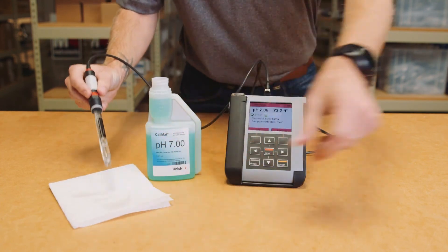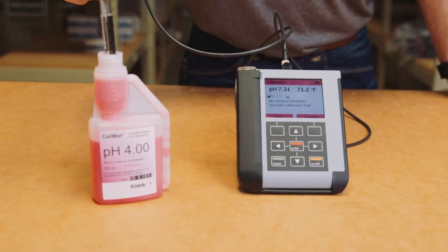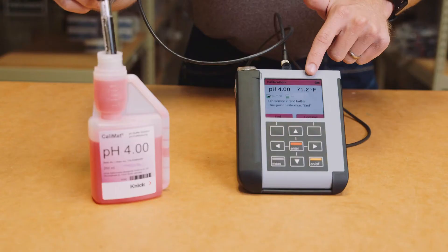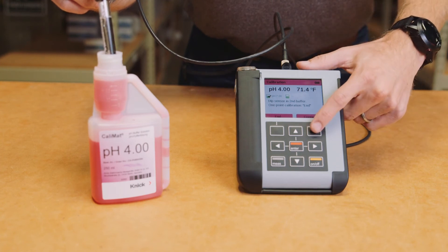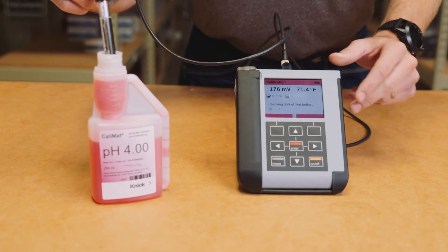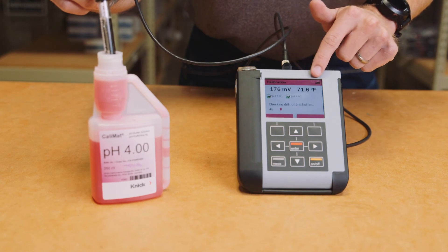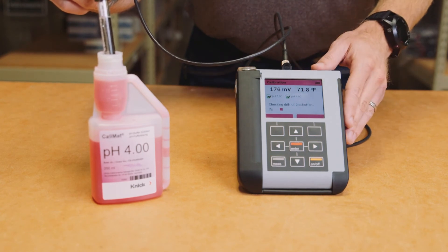Now repeat the process in the second buffer — stir lightly and make sure the junction is completely immersed. It's very important that the pH and temperature values stabilize before you press Continue. Once the values have stabilized, press the Continue button on the Portavo. The meter will now check the drift of the second buffer, automatically indicating its value and again displaying the millivolt and temperature.